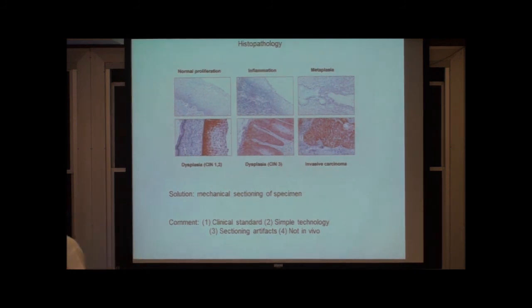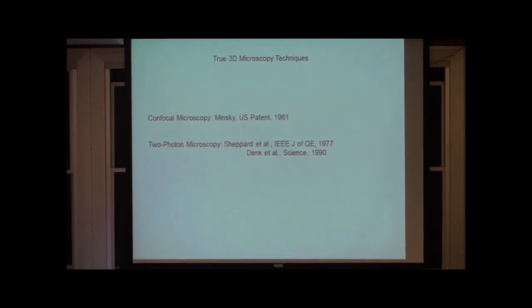And it is not an easy thing to do because cutting generates a lot of artifacts and reconstruction of artifact-prone slices is difficult. But still, you should know that this is in some way a very traditional gold standard in the medical field for generating 3D images. But as an optical guy like me, if I am thinking about true 3D imaging, I am thinking about methods that inherently give you three-dimensional resolution.